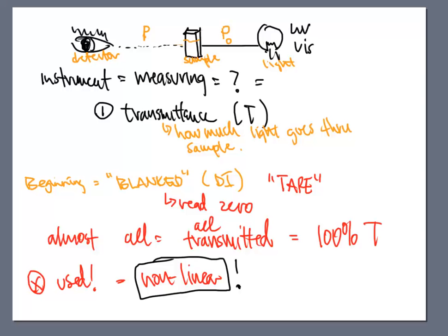We love calibration curves that make straight lines. 0.99999 or a perfect 1 is what we go after. However, these nonlinear curves cause us an issue because it's really hard to do data analysis with it sometimes. So because of that, percent transmittance is not really used in a laboratory environment anymore.